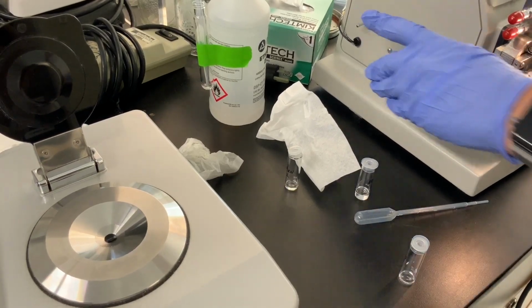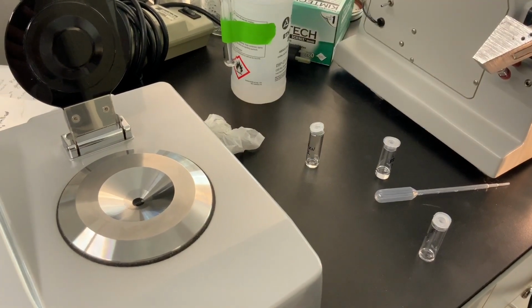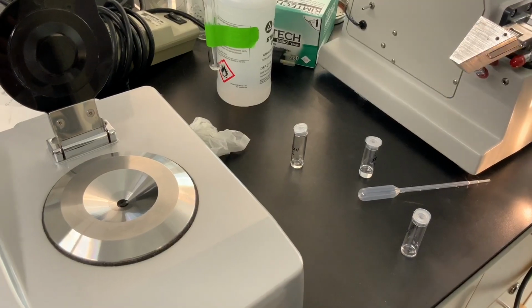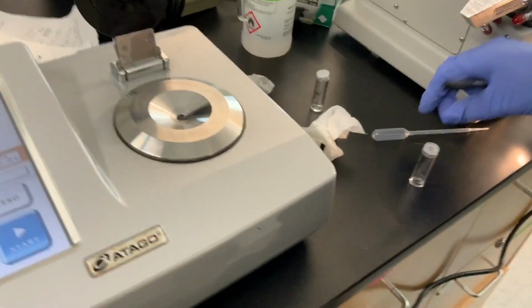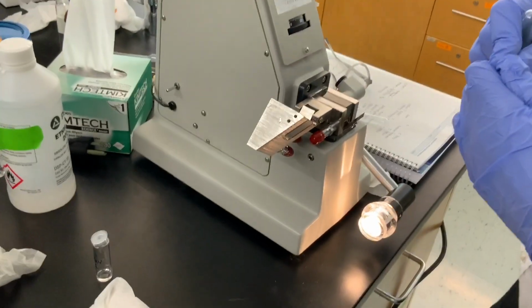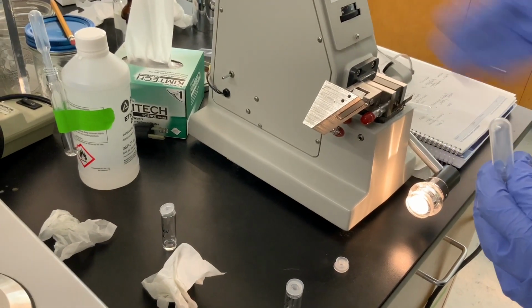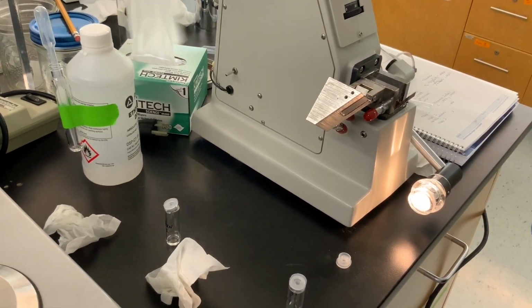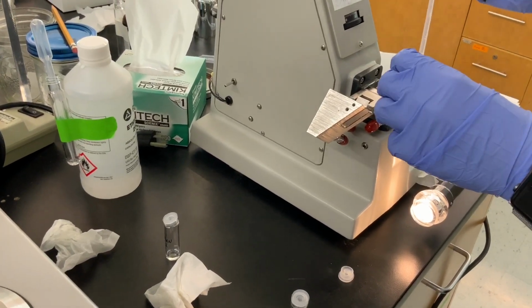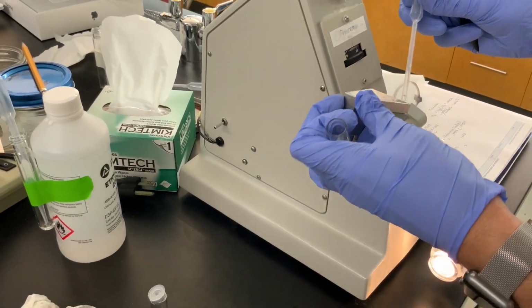All right, and then while we're here, might as well do fraction 3. Let the vapors go away. I'm wasting these chemicals. So now, of course, this should be closer to the refractive index of toluene.